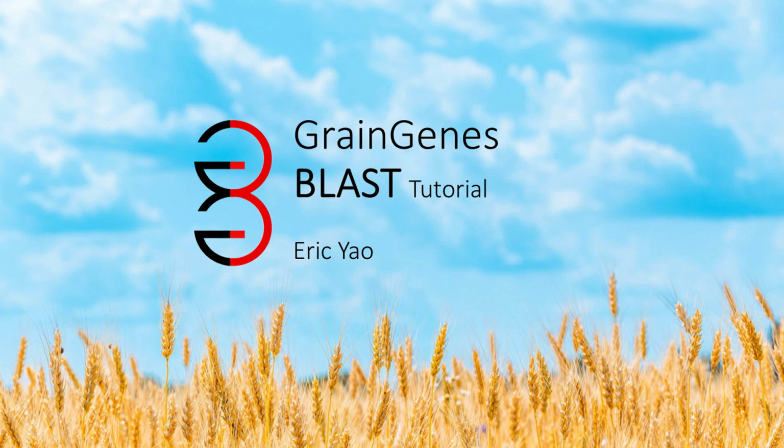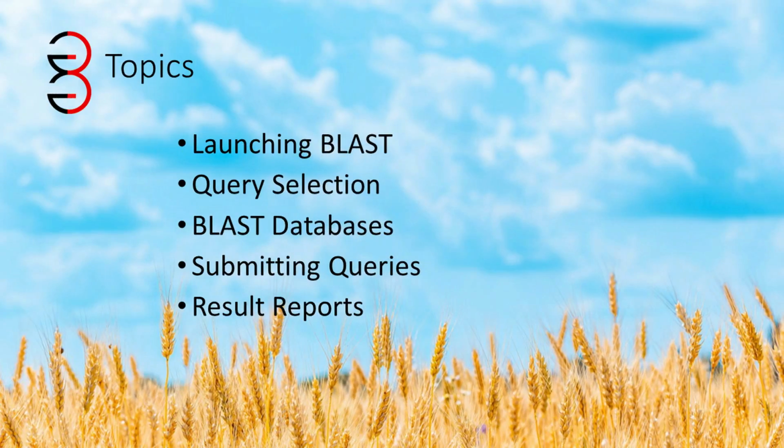In this video, I will describe the GrainGenes BLAST application covering the following topics: launching BLAST, query selection, BLAST databases, submitting queries, and result reports.